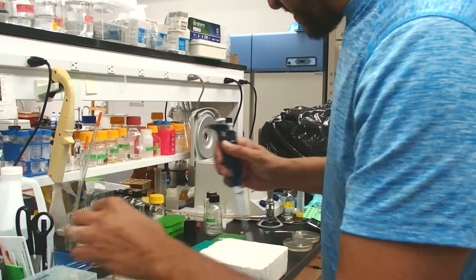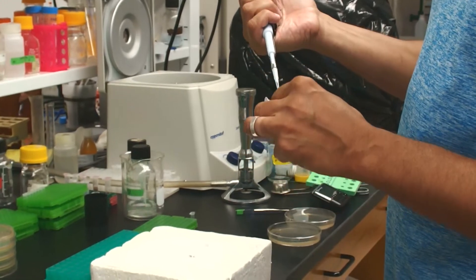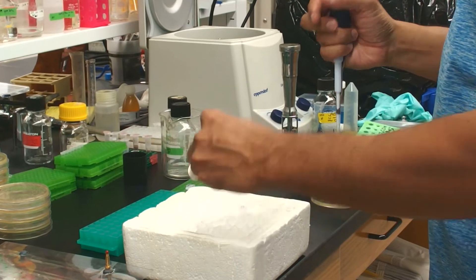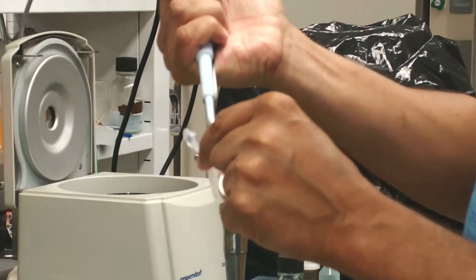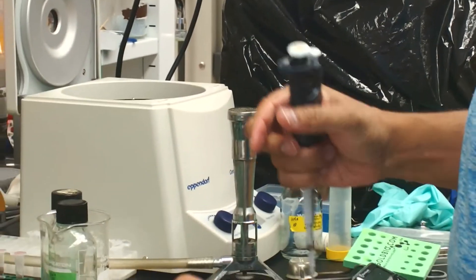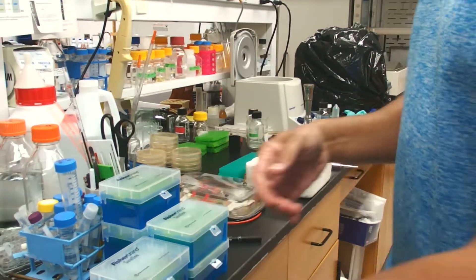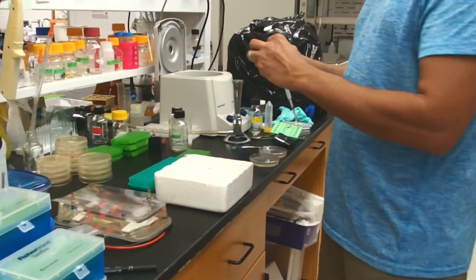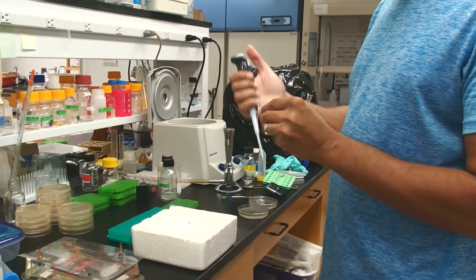I'm going to add one microliter of this plasmid for a transformation. I put that one microliter in there, close it up and get it back on ice. Then I'm going to pipette one microliter of this ligation into the other tube of competent cells.